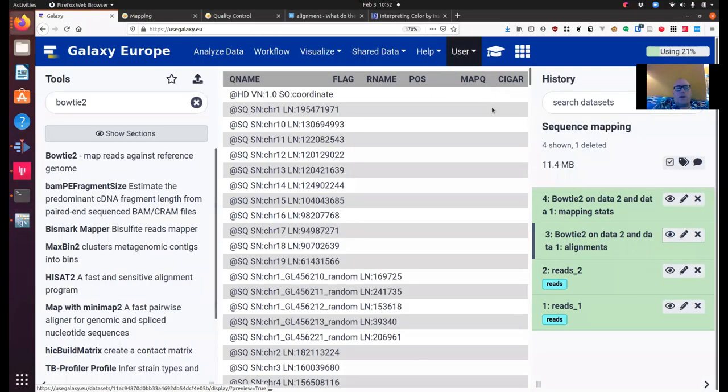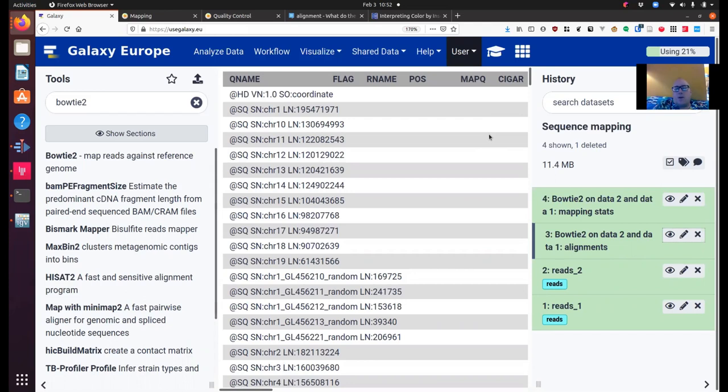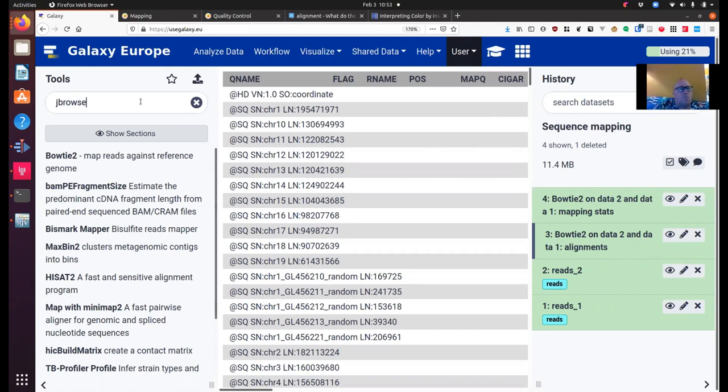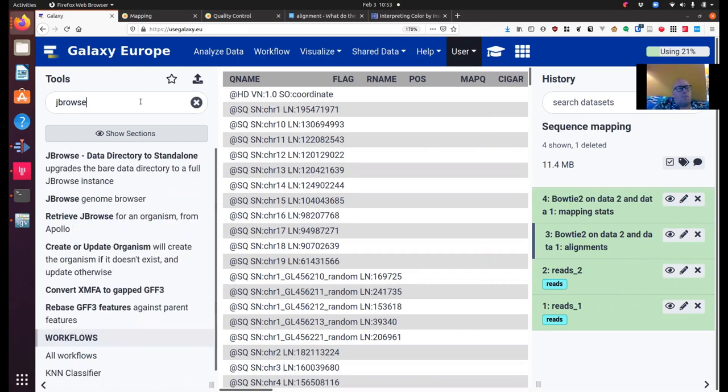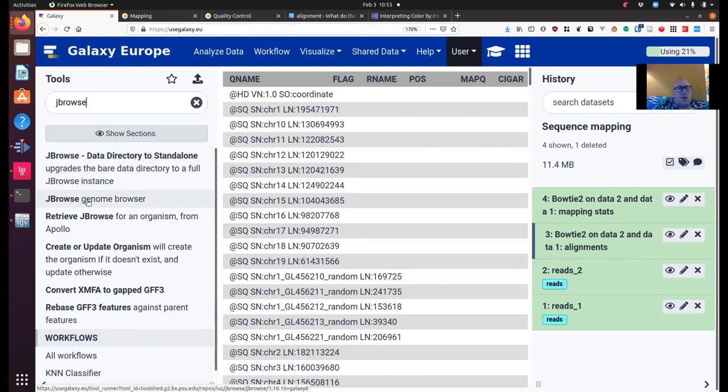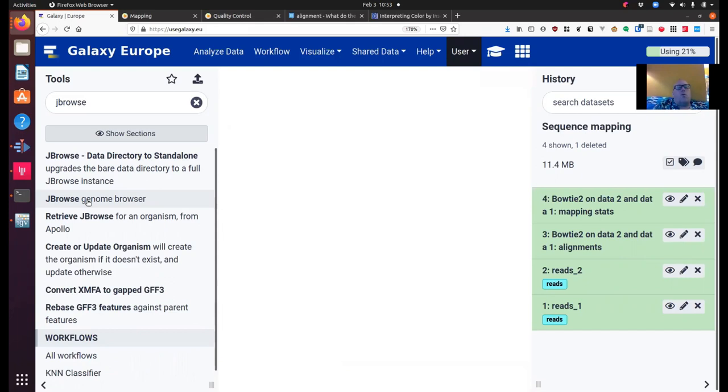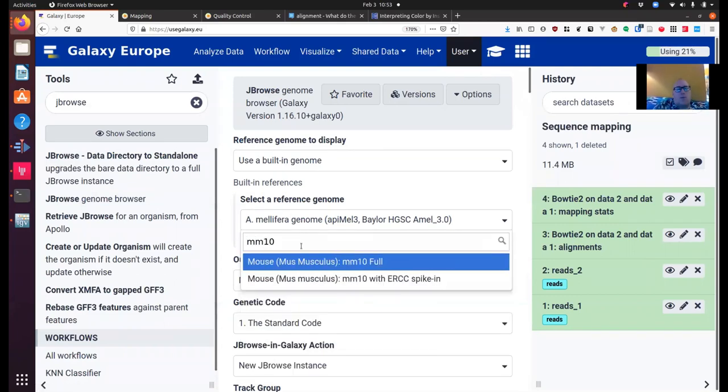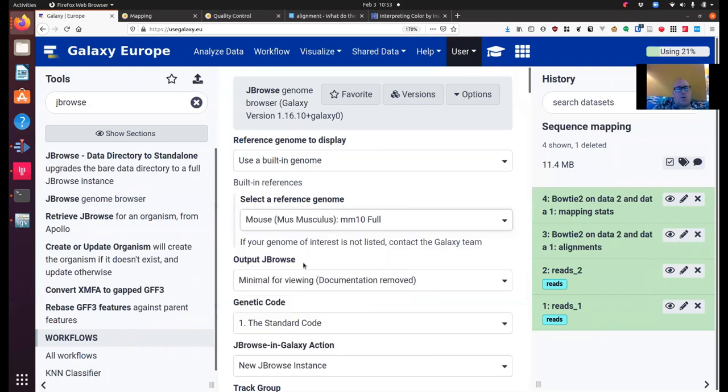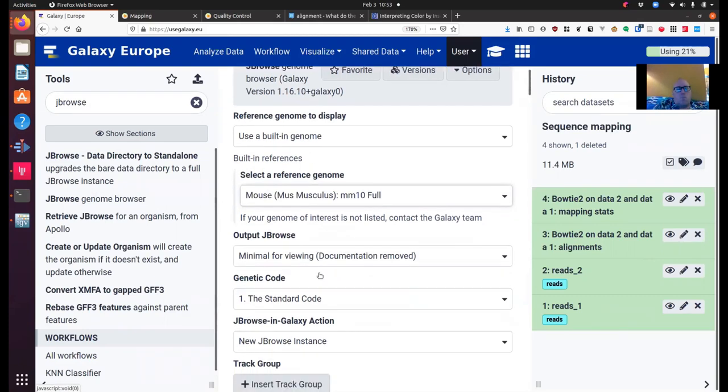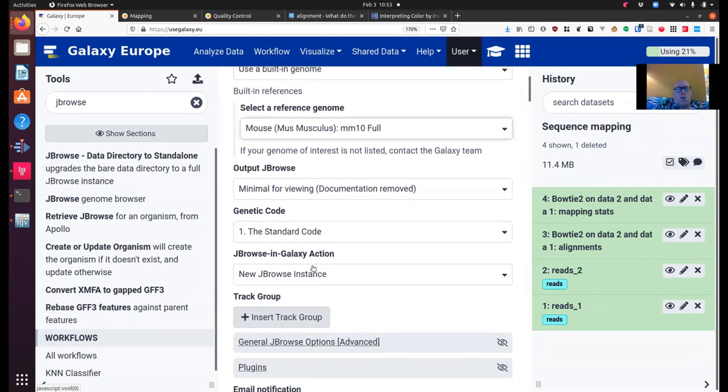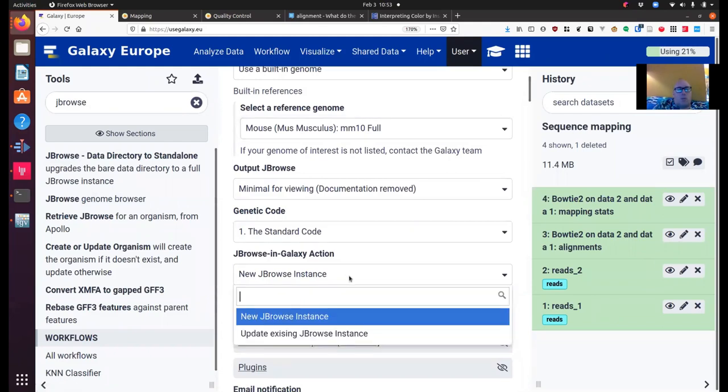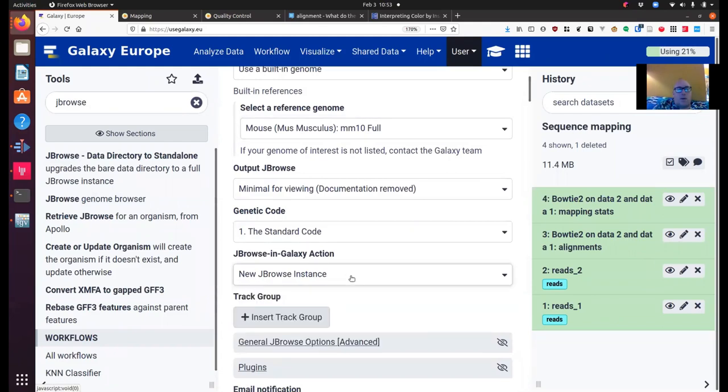Now going back to Galaxy. I mentioned before that every time I'm working with data on my local IGV, it's downloading that data to my local computer. It can be time consuming. So we can actually also use an in Galaxy genome browser called JBrowse. So let's find JBrowse. JBrowse. And what we want to run is JBrowse, the genome browser, not any of these other organisms, not any of these other tools I meant. And again, we're going to use a built in genome. And we're going to use the MM10 genome. If you were dealing with a custom genome, you'd mention that here.